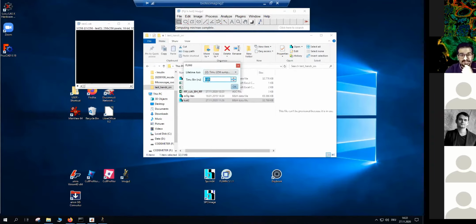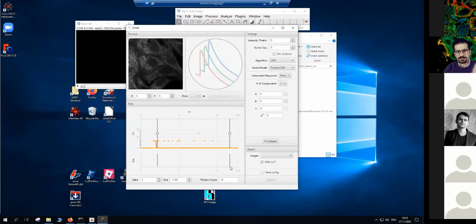Here it seems that it is reading the default for the point or comma, or also date. This plugin is reading that from the default of your system, and the default of my PC is assuming the comma as the decimal. I think that's the German way for the digits, and I was entering 0.01 or 0.5, not 0.05. So now if I add 5 here with the comma, it should be fine. Yes, so this is 12.5. It's now ending, and that's what I'm expecting. And choosing 1 pixel so we can see the decay. Yeah, so that was the problem of the comma or point.